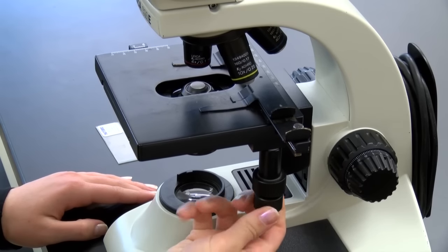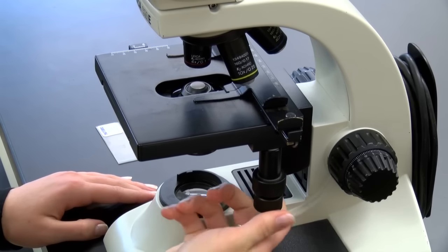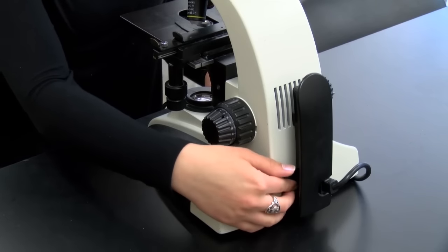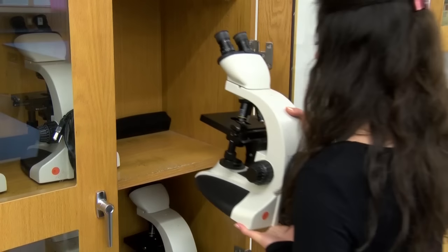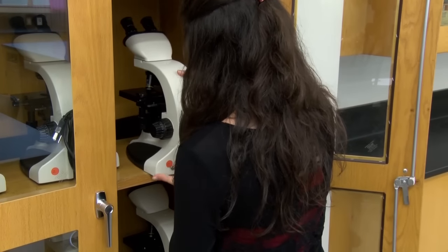Check that the stage is clean and dry. Turn off the light and power and wrap the cord. Carry the microscope with both hands back to the cabinet. Be sure that the arm is facing out and that the microscopes are not crowded together.